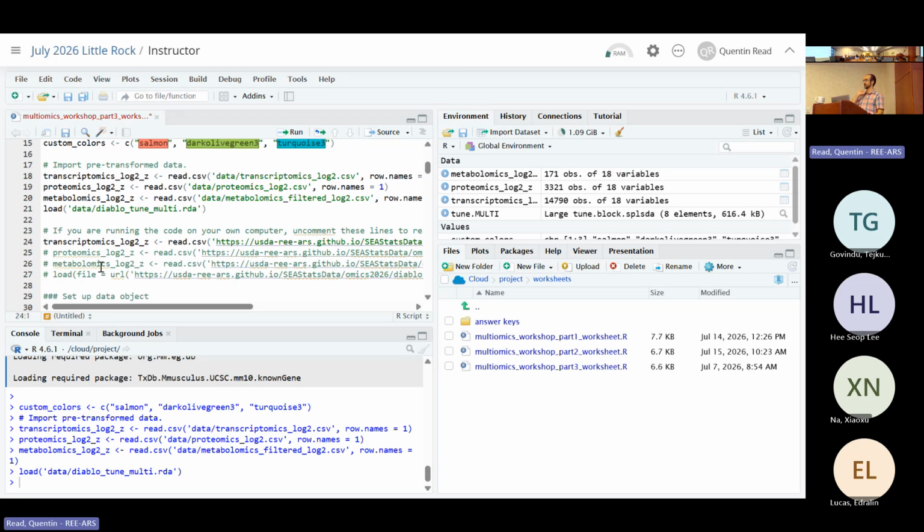Yes. I actually did get an error when I tried to look at. Okay. Let's take a look. The mixomics one. The mixomics, no, that one worked. Oh, it's still the mouse one. So should I just use the online? I see. Well, you can try to install it again. I thought it installed yesterday. Again, you try that. I don't know. Okay. Well, we can try it one more time, just for fun. Here, I'll just type it in for you real quick. You're good. Thanks.